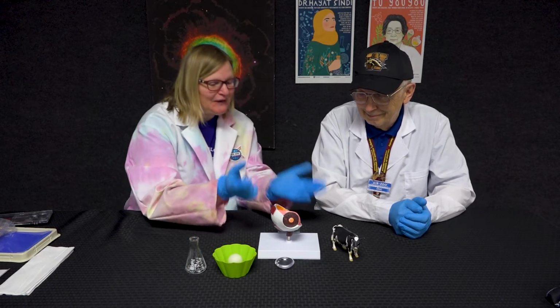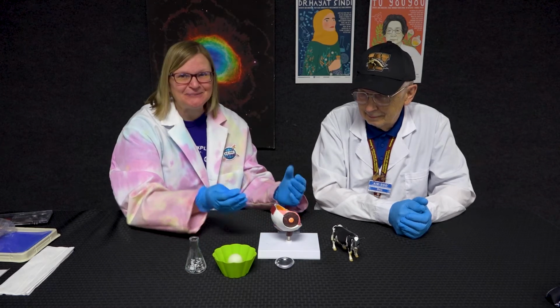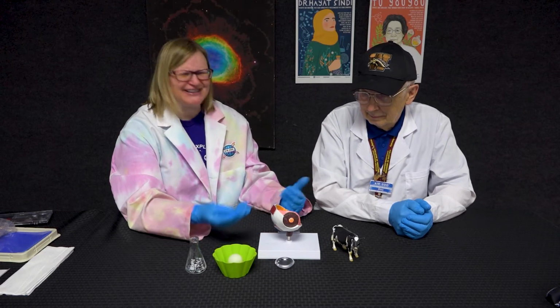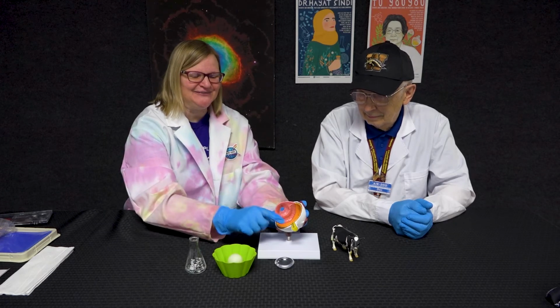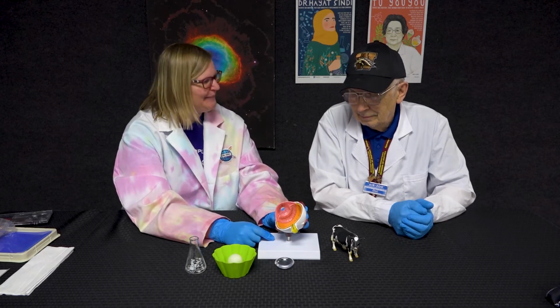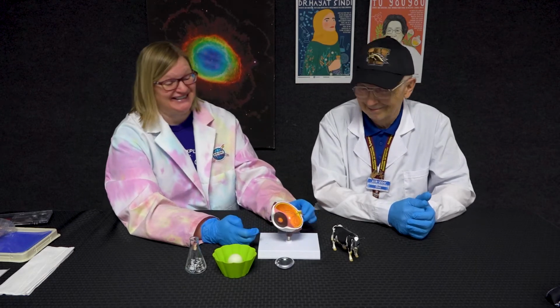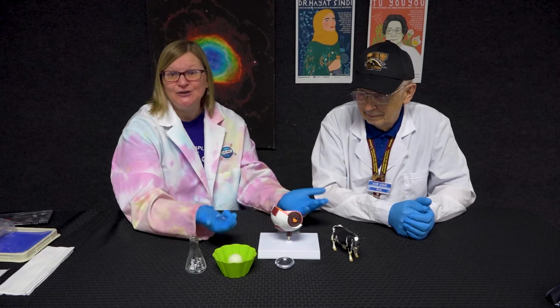And so the retina is where the light is being focused onto, and it has these specialized cells, and it's basically collecting all the information that your eye is gathering for your body. But that's not really where the vision happens. For vision to actually happen, all of that information has to travel through this special nerve at the back of the eyeball called the optic nerve. It's kind of a thick, protected cord, and that directs all the information to your brain, which does a lot of heavy lifting when you're seeing things. So you could have a completely functioning eyeball, but if you have issues with the optic nerve, you won't be able to see.